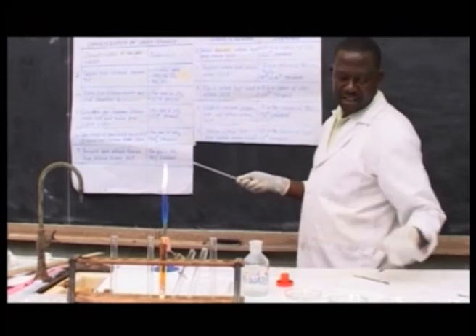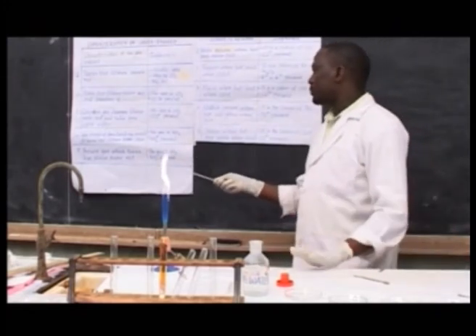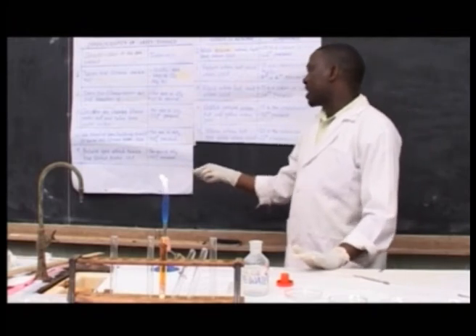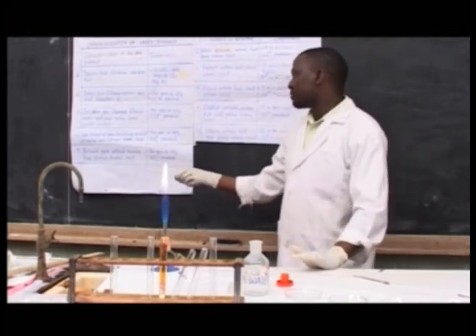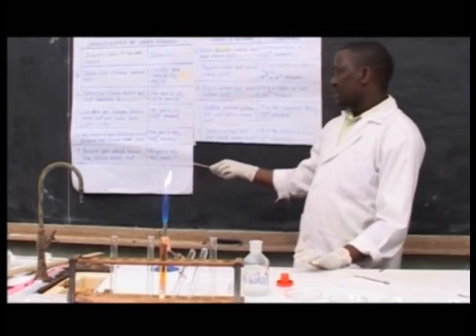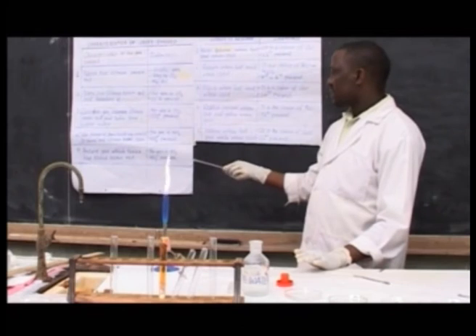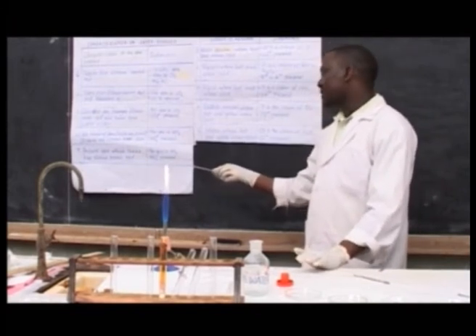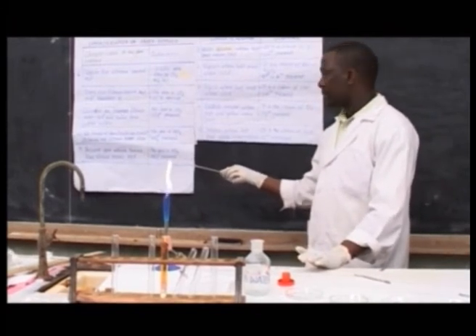On heating sample B, you observe that a brown gas which turned blue litmus paper red was evolved. The gas is nitrogen dioxide gas, and it suggests that there is nitrate ion in the salt.